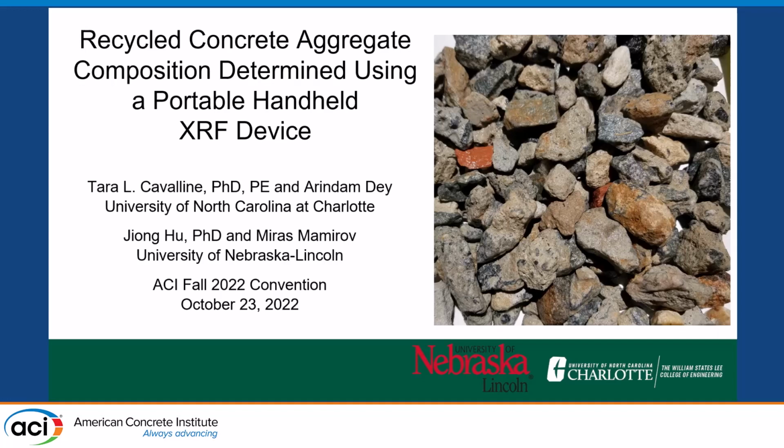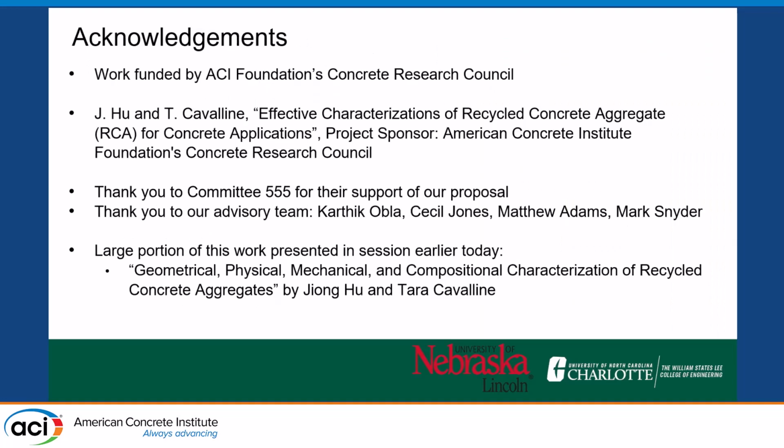to make sure that folks who get a pile of RCA, either from a single source or from multiple sources from C&D waste, can understand, number one, the chemical composition in terms of potential contaminants and other components that might be in there, and also, probably more importantly for confidence, the residual mortar content. How much residual mortar content is in there? I've got some recycled aggregate here on the front cover. You can see it's a composite material. It's the base aggregates that were in there as well as a mortar fraction. So I'm going to talk a lot about residual mortar content as part of my presentation here.